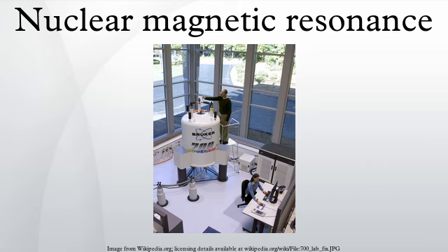Other nuclei. Applications, medicine. The application of nuclear magnetic resonance best known to the general public is magnetic resonance imaging for medical diagnosis and magnetic resonance microscopy in research settings. However, it is also widely used in chemical studies, notably in NMR spectroscopy such as proton NMR, carbon-13 NMR, deuterium NMR and phosphorus-31 NMR. Biochemical information can also be obtained from living tissue with the technique known as in vivo magnetic resonance spectroscopy or chemical shift NMR microscopy.